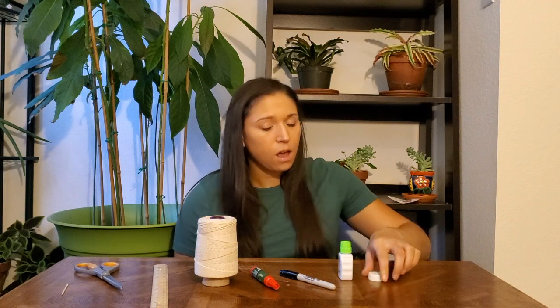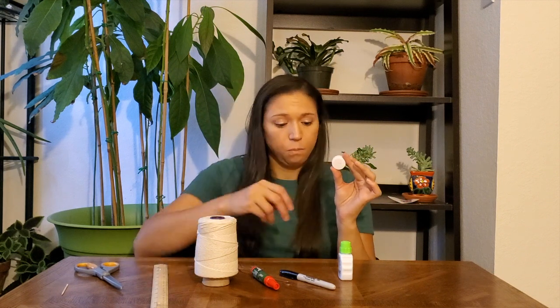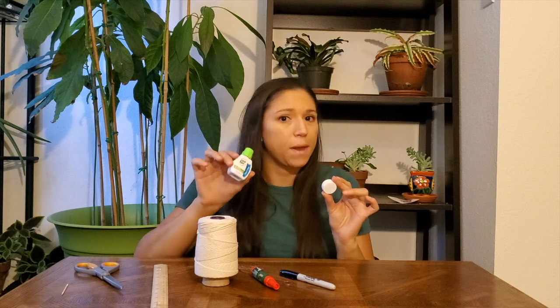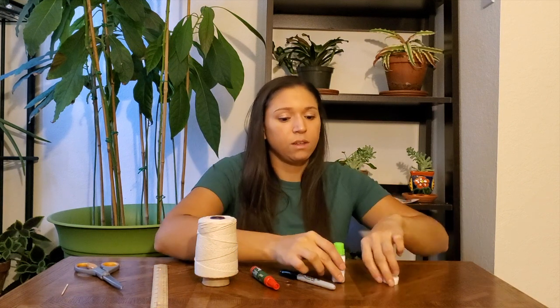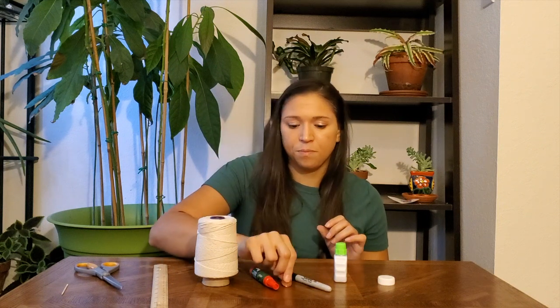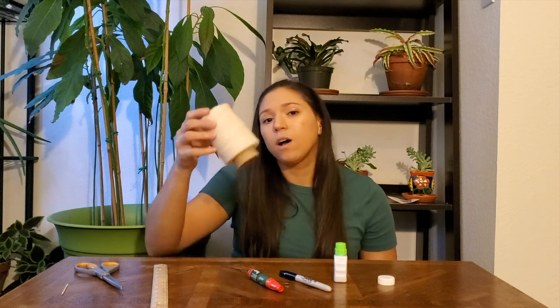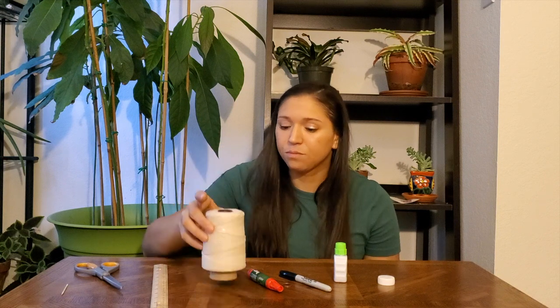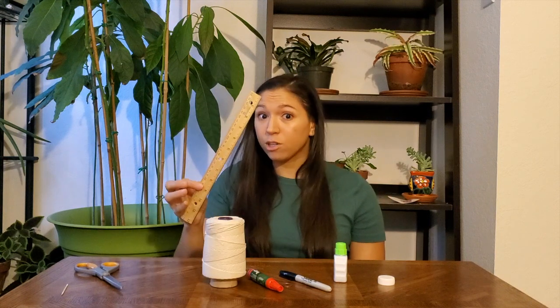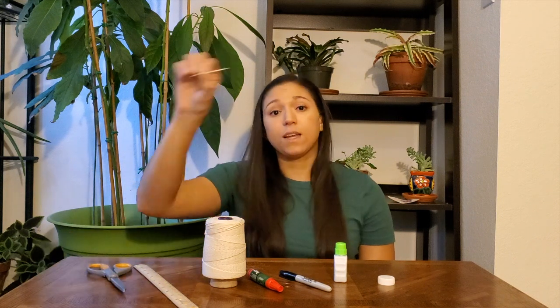To do this activity, we'll make a mini Secchi disc. Here are the supplies you're going to need: a bottle cap — try to find a white one, but if you can't, you can use white-out or white paint to color in the white sections — a Sharpie, a penny, some hot glue or super glue, some white or light-colored string, a ruler, a pair of scissors, and a toothpick.